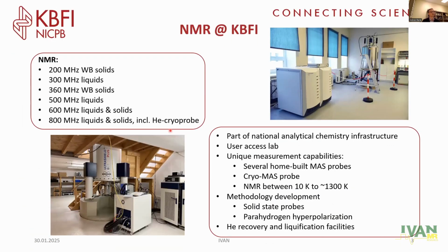In terms of NMR laboratory, we are the largest laboratory in the region with right now about, depending how you count, 6 or 7 different instruments, and also historically a hardware development center where we still have a good range of home-developed MAS probes, a home-built cryo-MAS probe that was running here about 10 years before a commercial alternative became available.